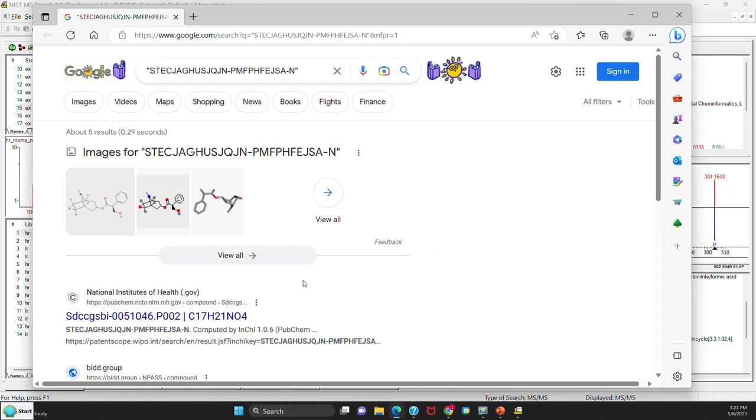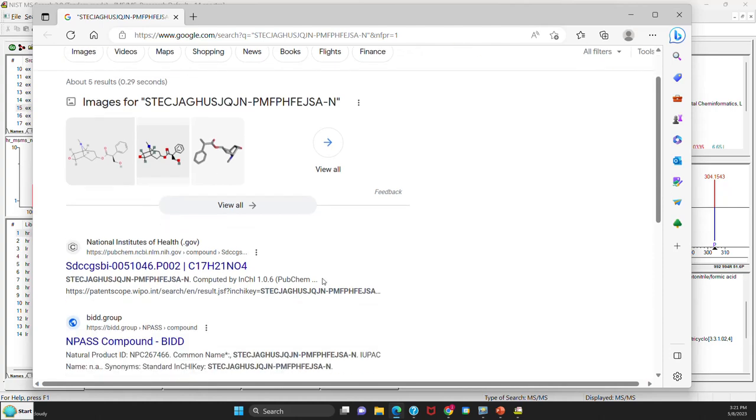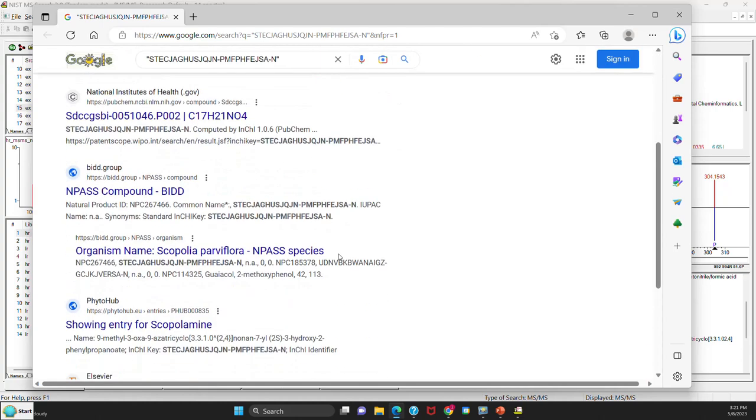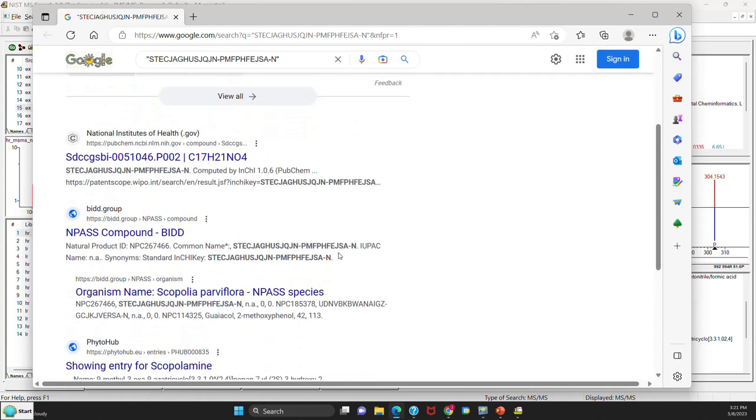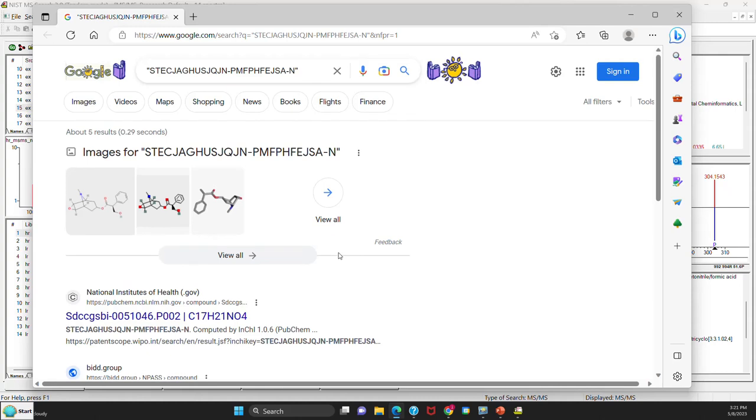And in this case, of course, the PubChem results will be a part of the Google search. So you really haven't lost anything. You just have additional information.